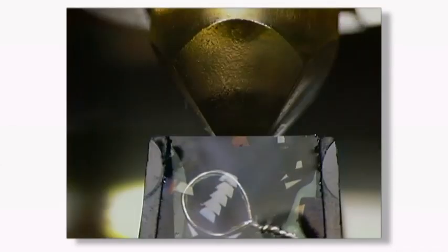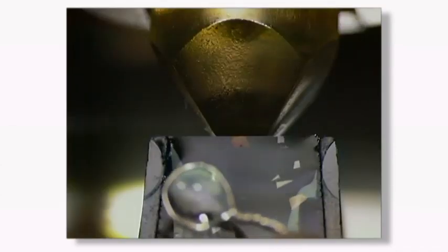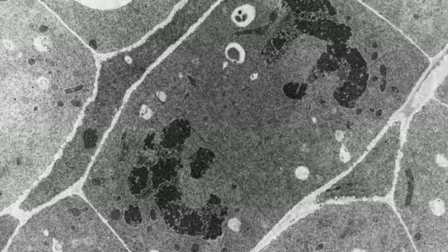The interference color of a section indicates its thickness. Good TEM sections should be uniformly gold or silver. Sections can now be collected onto a TEM grid, post-stained, and viewed under the TEM.